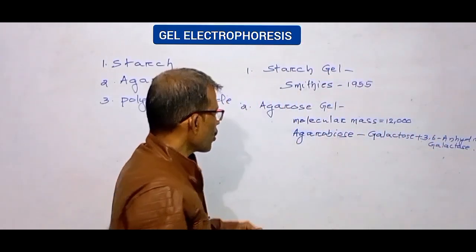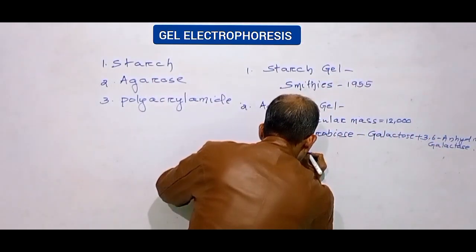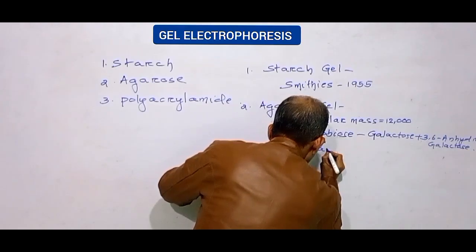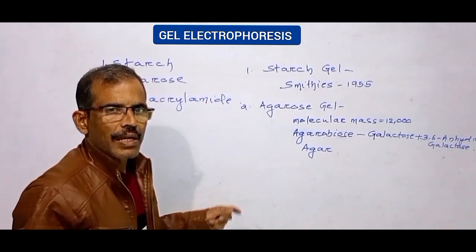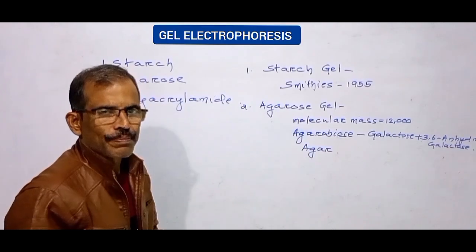Agarose is a component of agar, which is a mixture of polysaccharides that has been isolated from certain seaweeds.